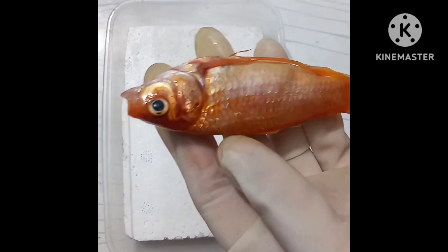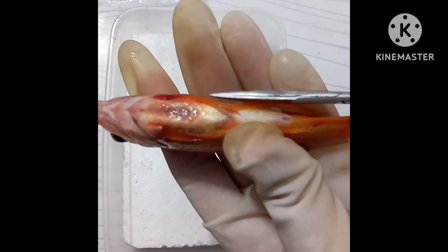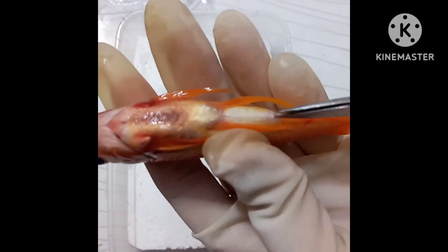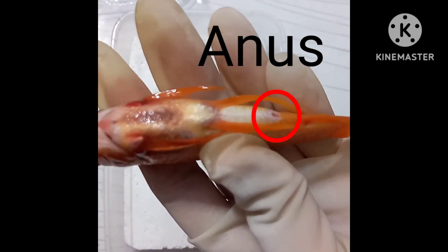Assalam alaikum friends, today we are going to do the dissection of a fish. For the dissection purpose, we will start to cut the fish from its anus — this hole is its anus, which is used as an excretory system.